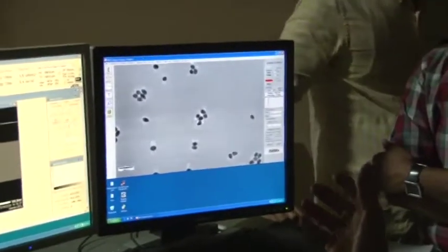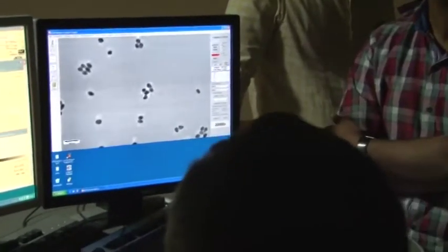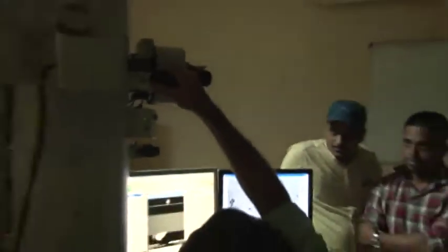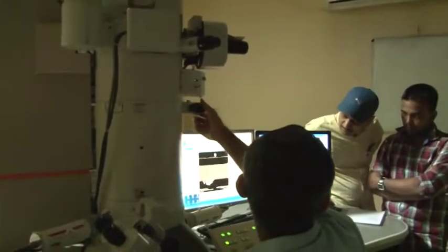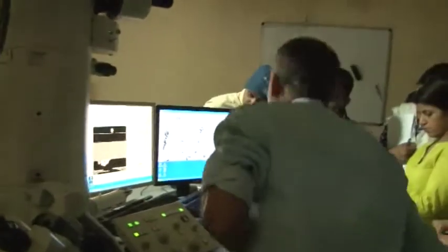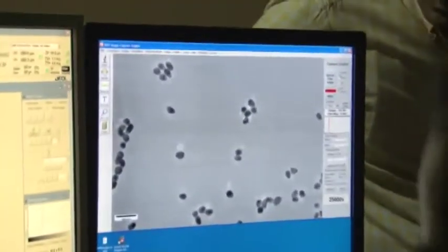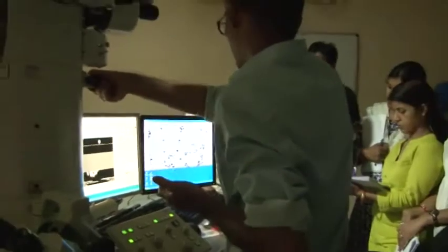I mean you can use the largest aperture. You don't care about the amorphous substrate, you know? Yeah, but I think right now there is no selected area aperture at the moment. Yeah, but it means it's a large one. I mean, you don't need perfect rings, just to demonstrate. Okay, all right. So there should be some. Okay. So now we try to make a diffraction pattern from this, or indeed let's have the largest one just to show them. Okay.